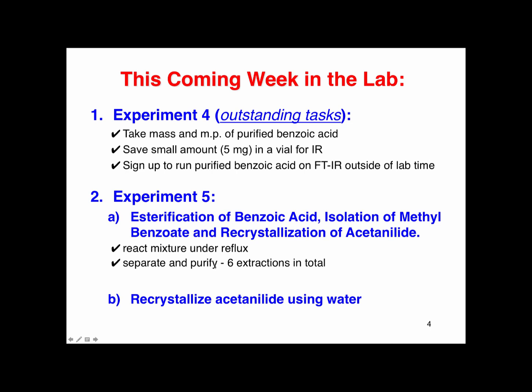And just to prepare you, you're going to have to do 6 sets of extractions, a couple with water, and then you're going to do some other extractions, and then more with water. We'll talk about those in more detail in a little bit.